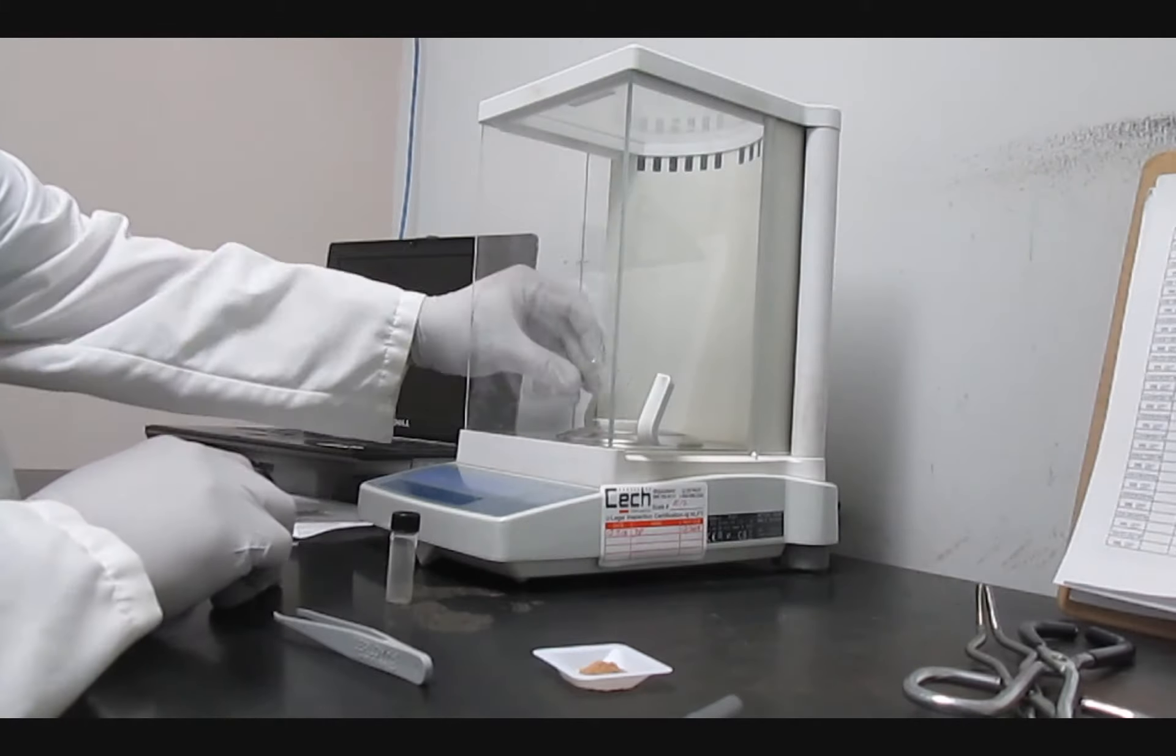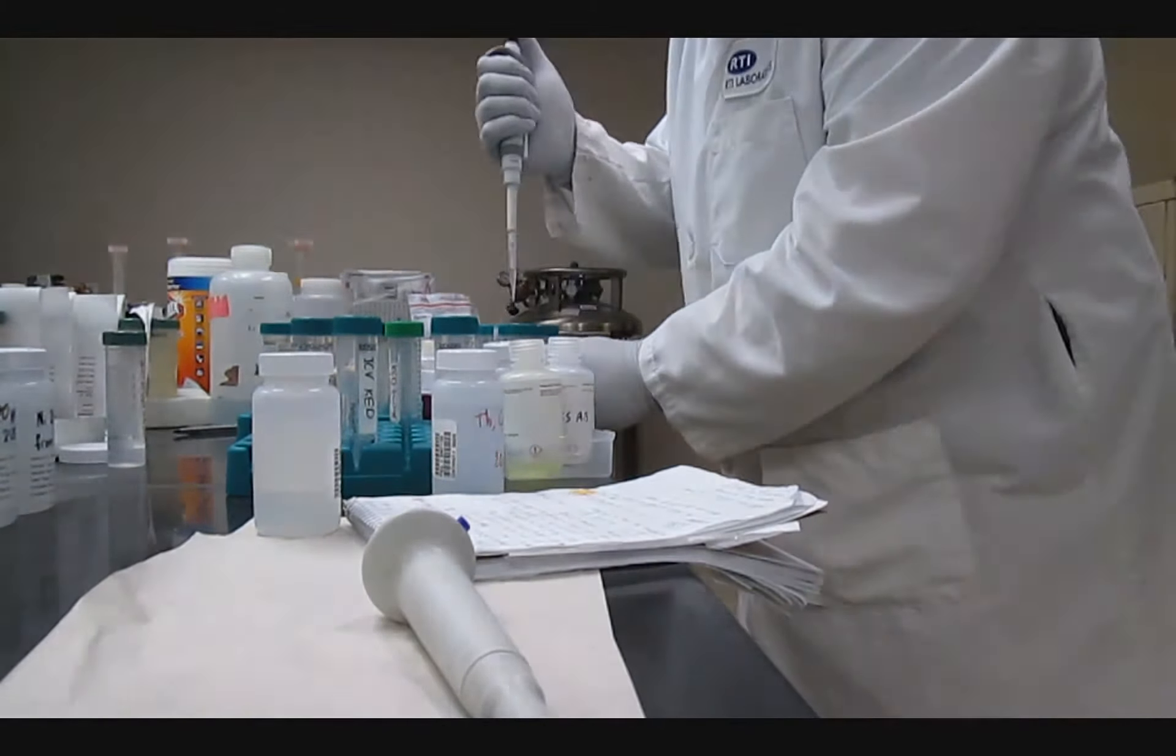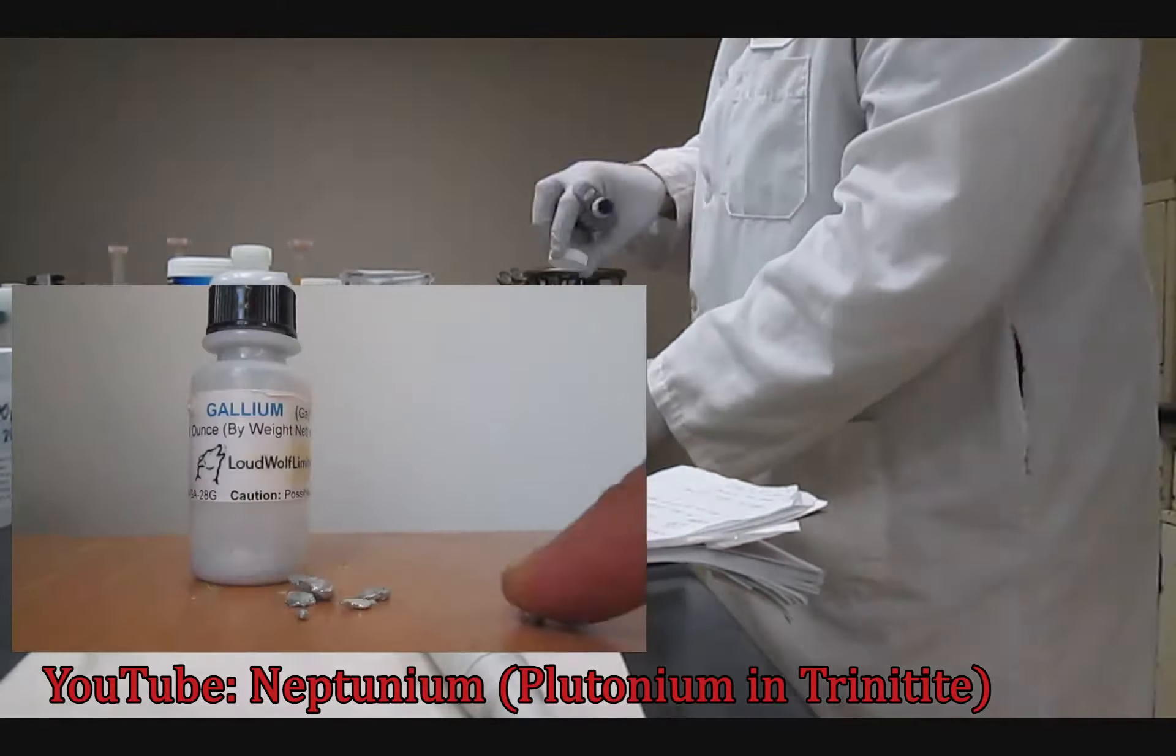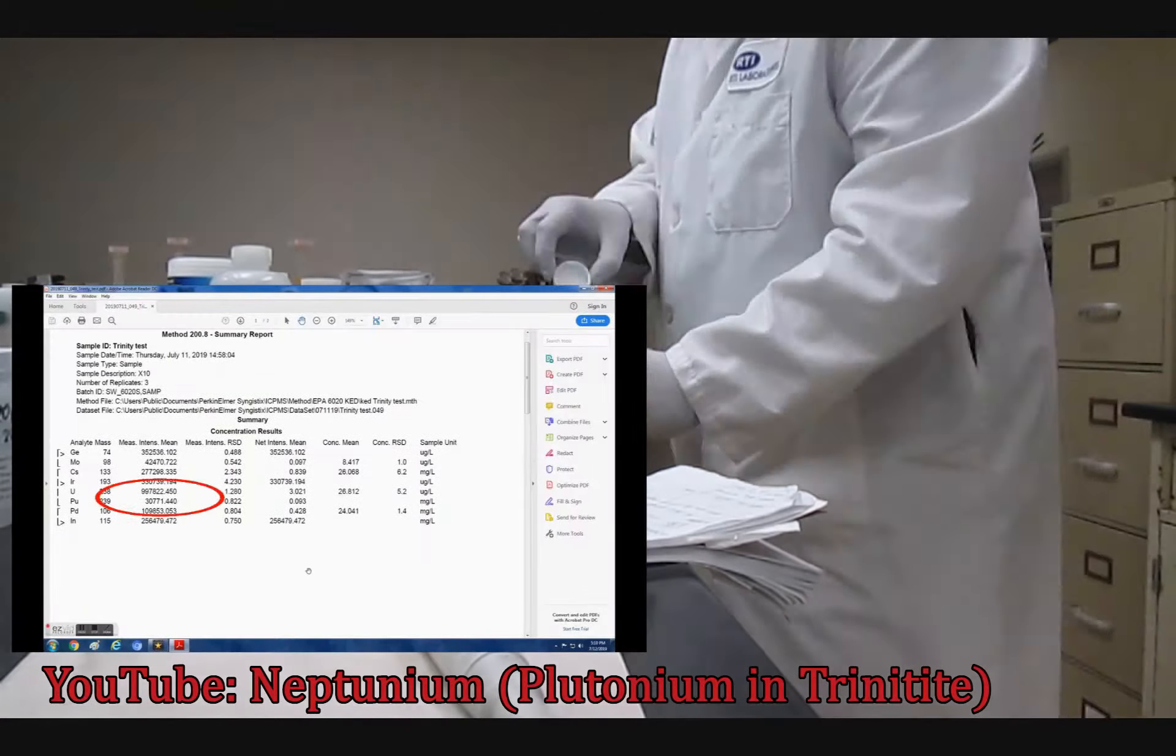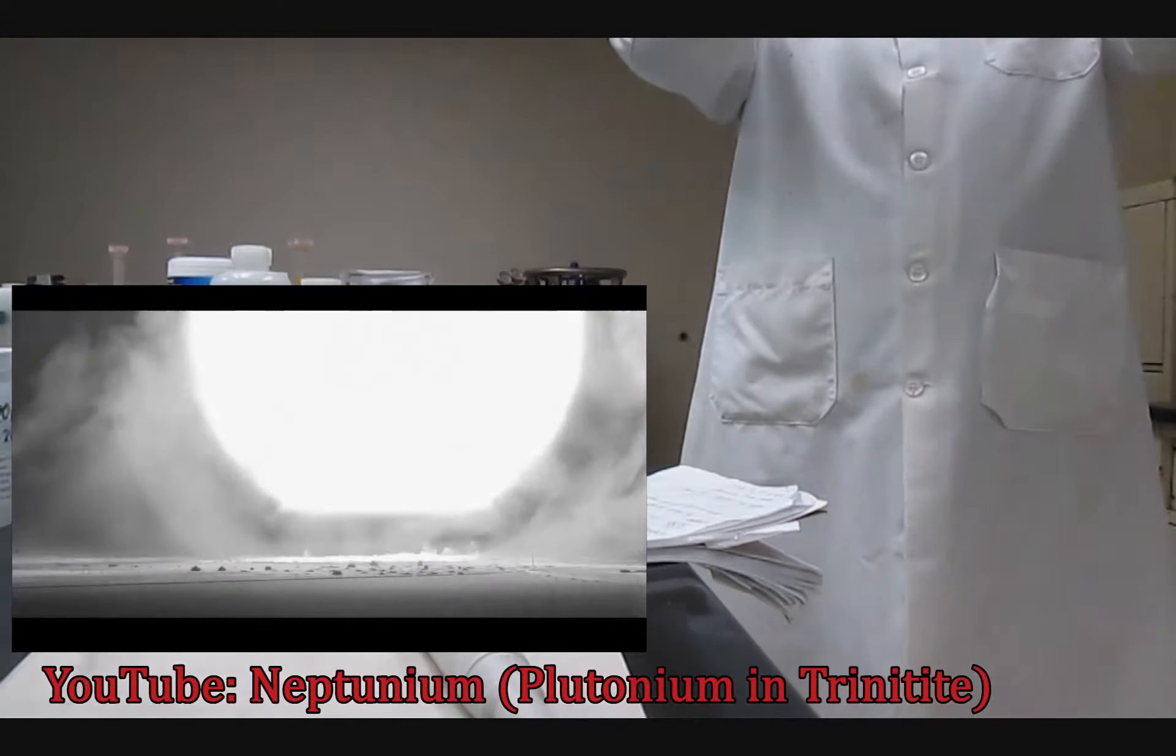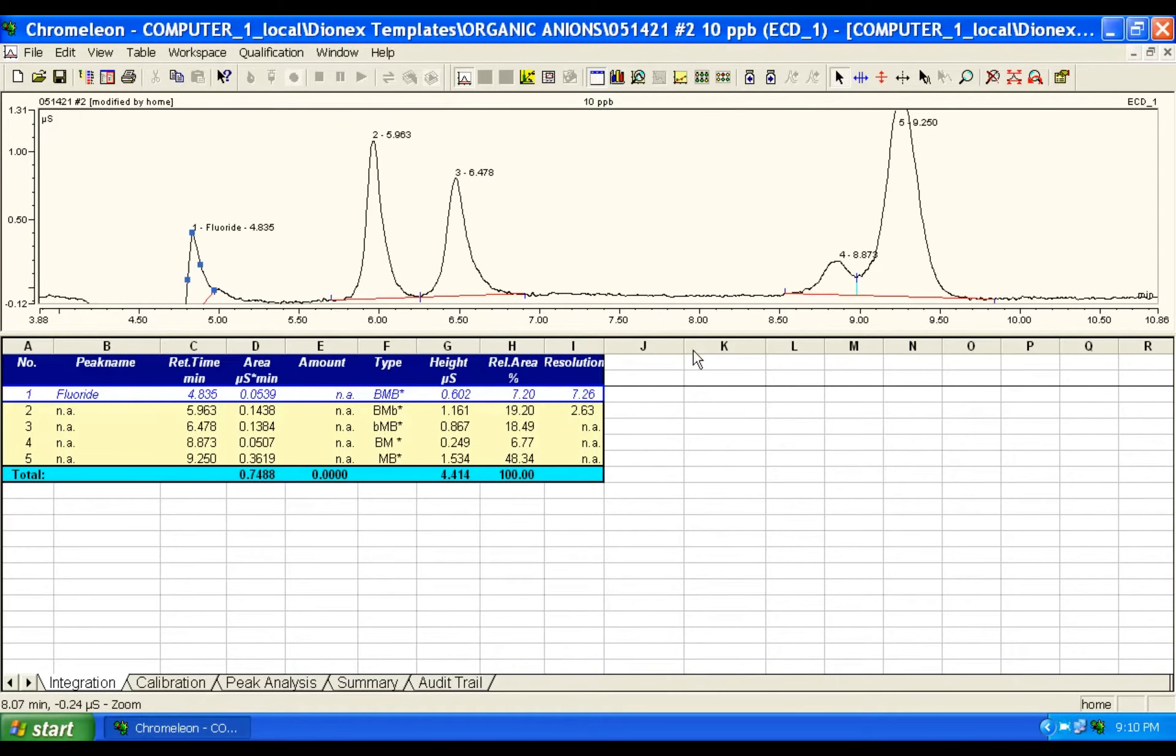And here lies one of the biggest problems in analytical chemistry. Some analytes behave the exact same way under similar conditions, but are actually completely different. Similar problem with the mass spectrometer and the isobaric interference between molybdenum isotopes and technetium in the plutonium and trinitite video. But I digress. There is something else I wanted to try, and I haven't talked about it yet.